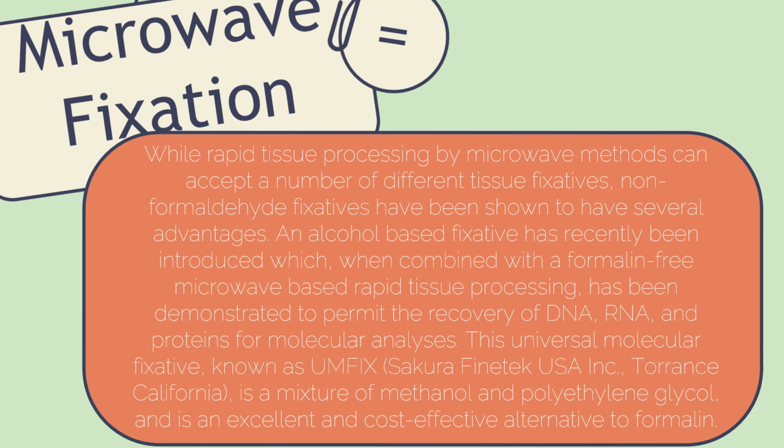So this universal molecular fixative known as UMFix, Sakura Finetech, USA Incorporated, Torrance, California, is a mixture of methanol and polyethylene glycol and is an excellent and cost-effective alternative to formalin. So take note of the universal molecular fixative known as UMFix.